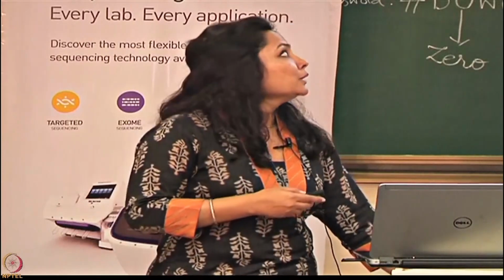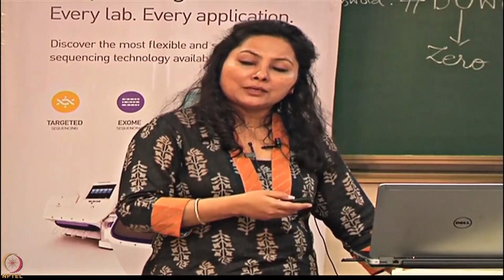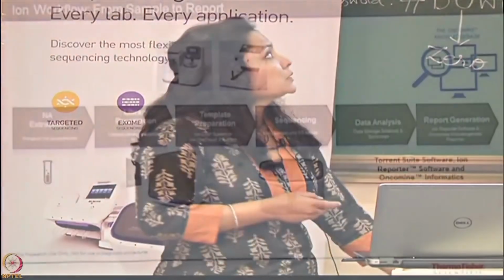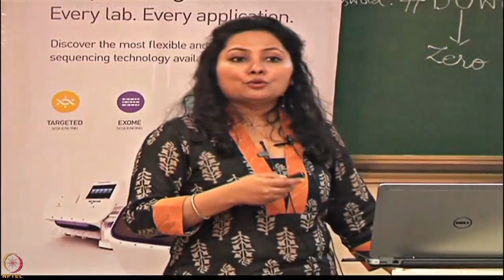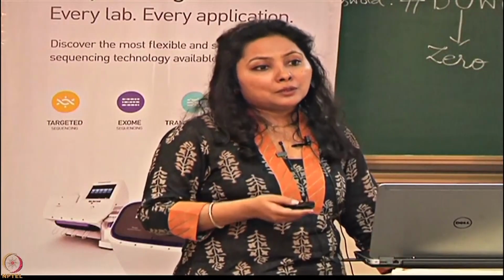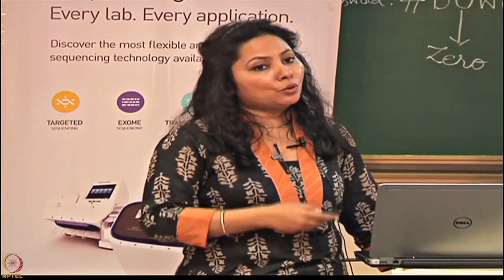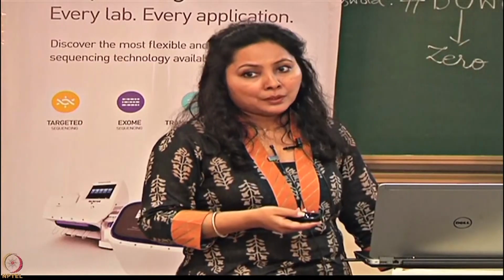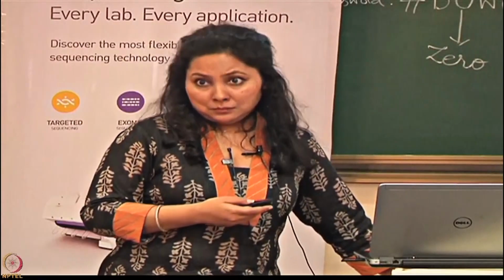So that process of taking these library molecules and amplifying them onto the ion sphere is called template preparation. Then comes sequencing. Now you have your ion spheres which are templated, which have library molecules amplified onto them, and now you want to sequence. So you load these ion spheres onto the chip and then you generate the data.